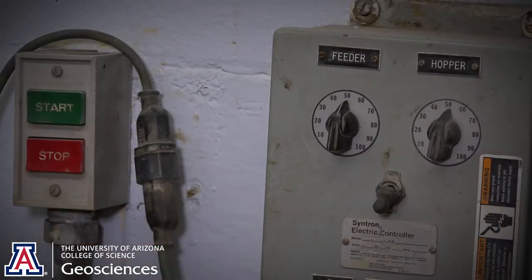Next, we dump it into a pulverizer chute, and the goal here is to take it down into the sand.